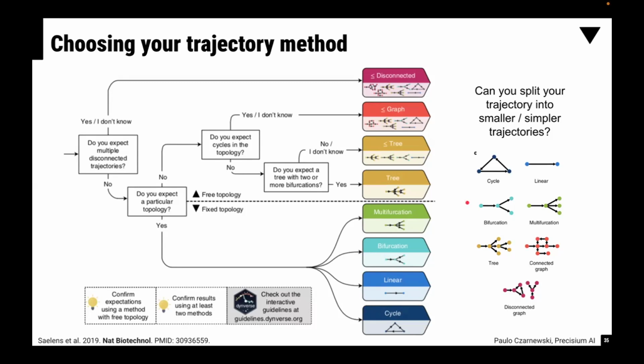So what you need to do is select, for example, the Th17s to Th1 cells, select just those cells, and then do a linear trajectory on that. Because then you can try to see what the paths are between the Th17 state and the Th1s. Most of these methods assume that there will always be an end, so these kinds of reverse processes, as you can see in all the arrows here, are usually never taken into account.